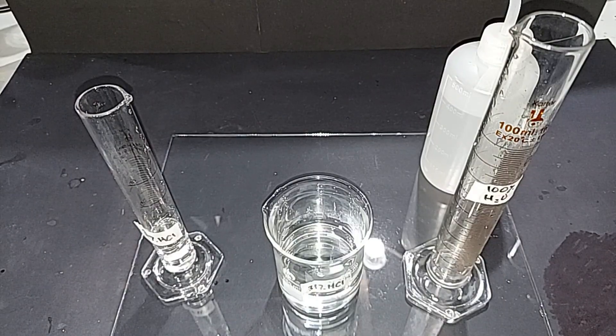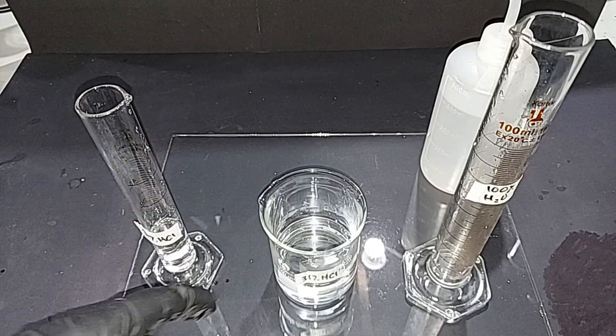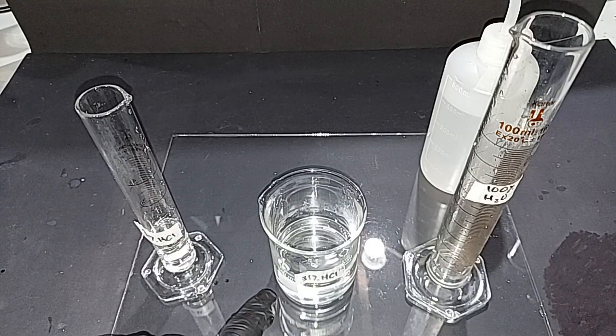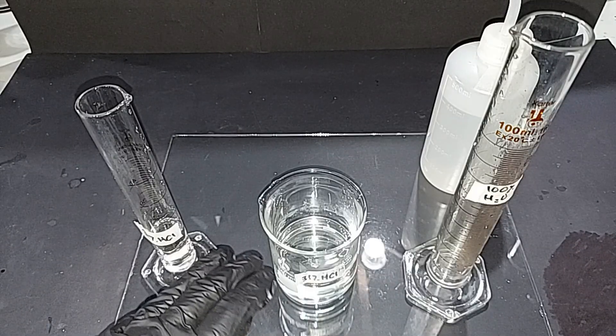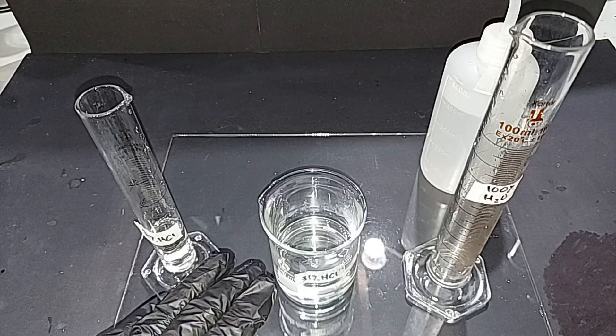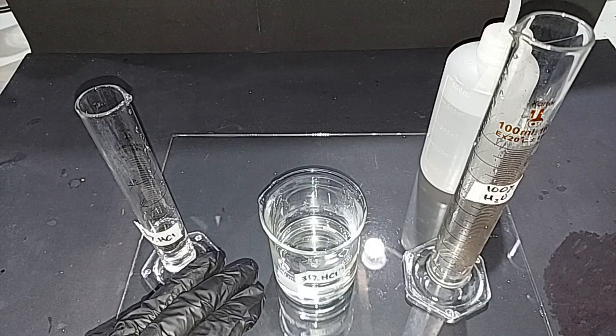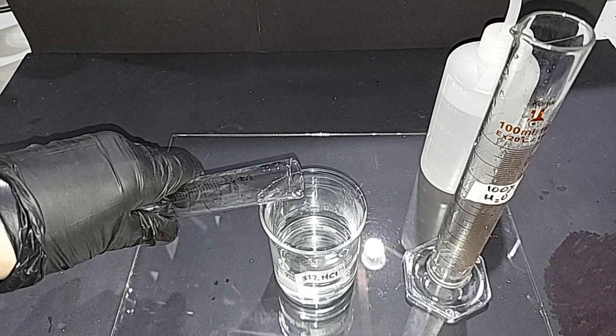Before mixing, a quick safety note: the 31% hydrochloric acid is forming an equilibrium with the air above it, producing fumes. Anyone who's worked with HCl knows it produces visible fumes when first opened. Number one: don't breathe it in. Number two: always be careful not to mix solutions too quickly, as you could get a large amount of fumes at once. I'm going to add the 19 milliliters slowly to make it 119 milliliters.